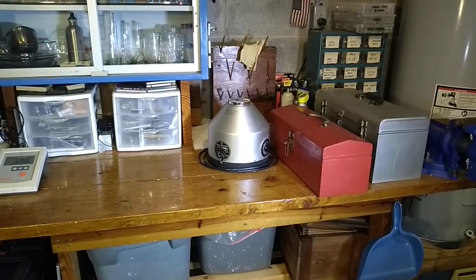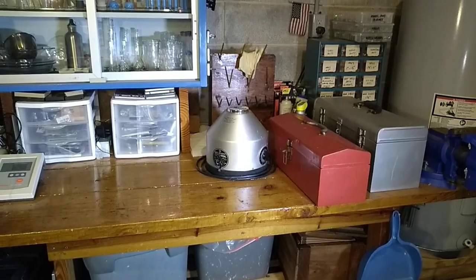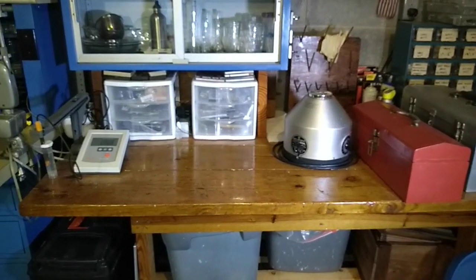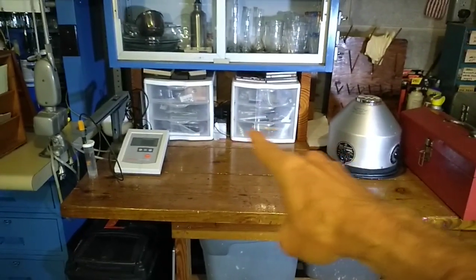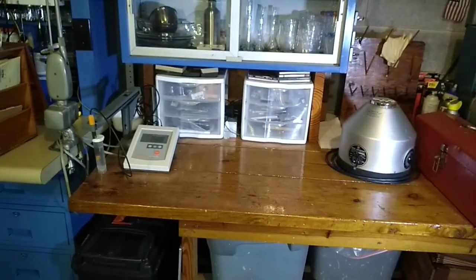You see to the right there's a couple toolboxes and a vise and some drawers with screws in it, but other than that it's mostly lab stuff. I got my centrifuge and pH meter, and these little drawer things I get a lot at the garage sales too, and they come in handy for storing stuff.